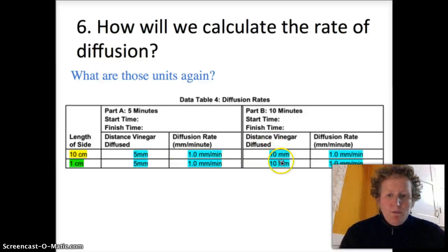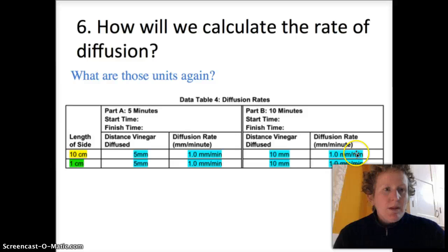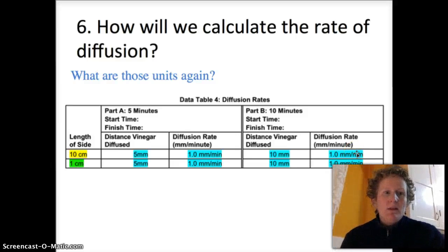We'll have to find out if this is true for our cubes going 10 minutes. We'll let them soak for 10 minutes. I'm guessing it'll go 10 millimeters. And if we take 10 millimeters and divide by 10 minutes we'll again get 1 millimeter per minute. So it doesn't really matter how long you let the cube soak or what size they are, the rate of diffusion is the same.